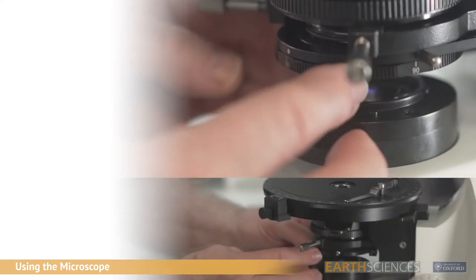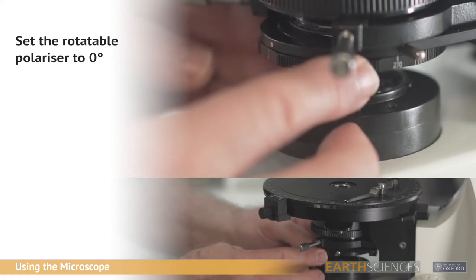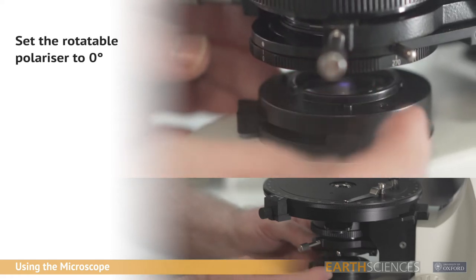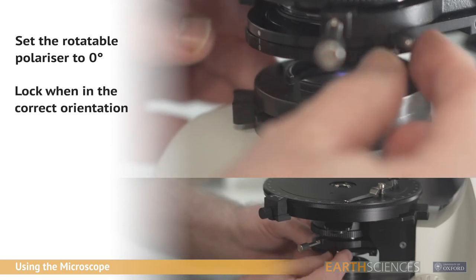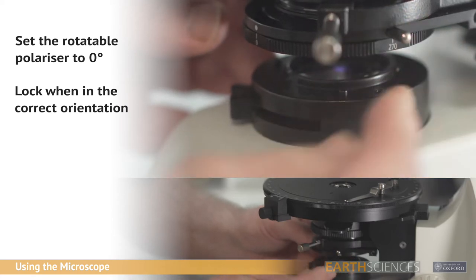Under the sub-stage condenser is the swing in-out rotatable polariser. This is marked with 0, 90, 180 and 270 degrees. Ensure that this is in the 0 degree position at the start of use. There is a silver locking screw to the right hand side.